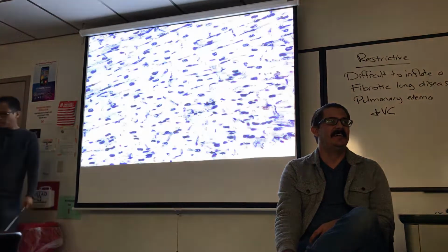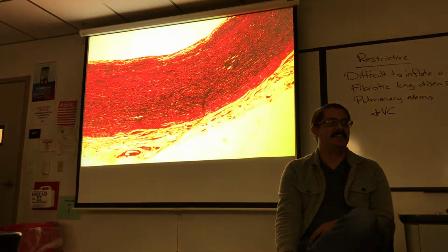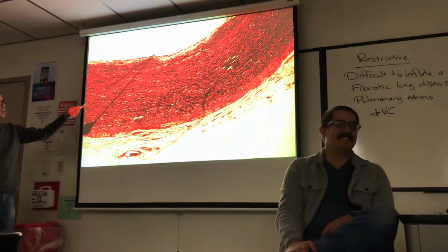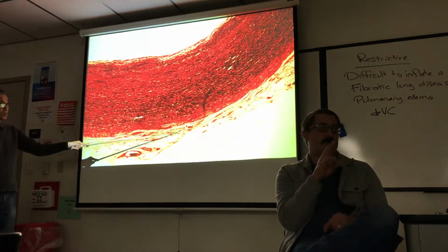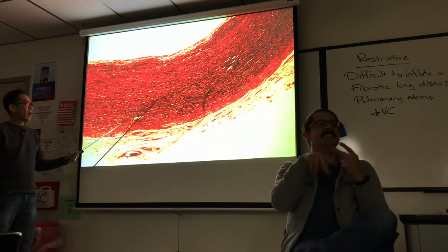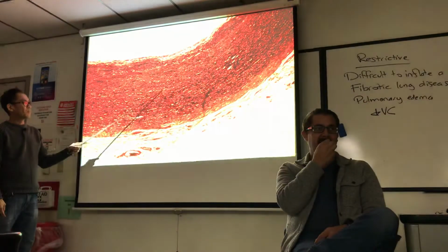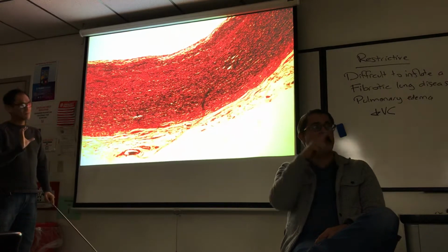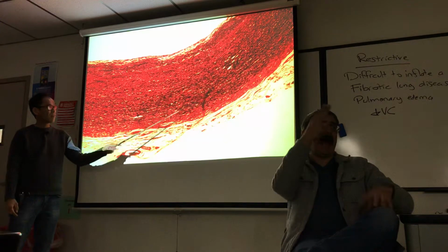The heart pumps blood into the arteries closest to the heart. Those are the elastic arteries. Here's an elastic artery right here, from top to bottom. You have the tunica intima, tunica media, tunica adventitia. The tissue types in tunica media are very obviously red and pink and black. Black are elastic fibers. And so you can see the high elastic content on an elastic artery.